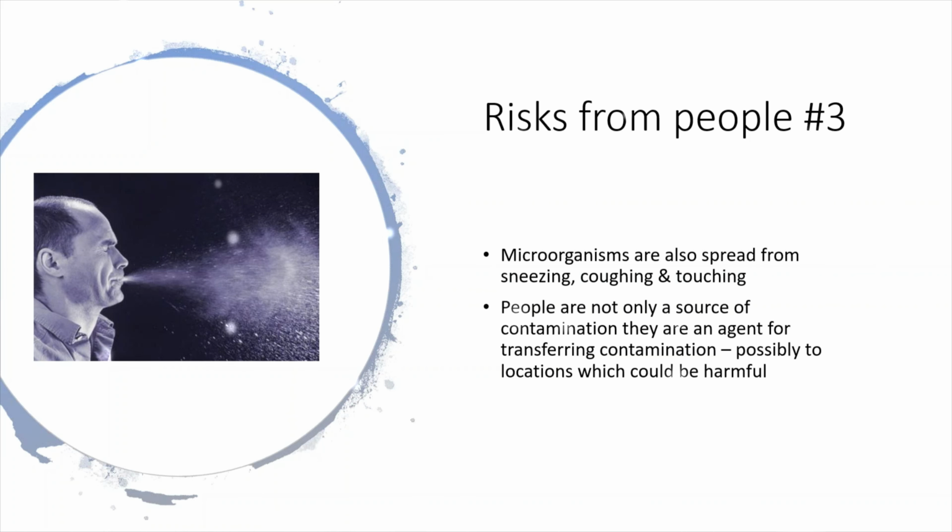And with people, the main concerns are with improper behaviour and in matters relating to gowning, like gown quality and the length of time that the gown is worn for. And people can also spread contamination, as we've already mentioned, through touching, but also through sneezing and through coughing.